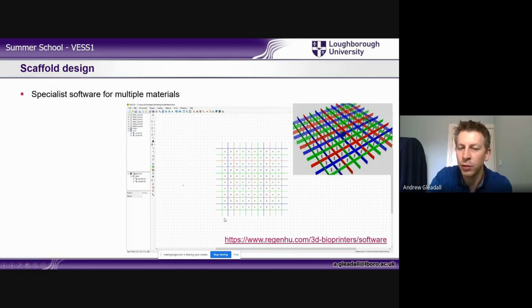So if you've drawn all these green lines, it might then decide the best order to print them in. Because if we print this line down here, the nozzle's now got to get from the end of it to the beginning of this one, or this one, or this one, or wherever it's going to go next. So it will still do some things in an automated way, but you have a lot more control over the layer's print path.